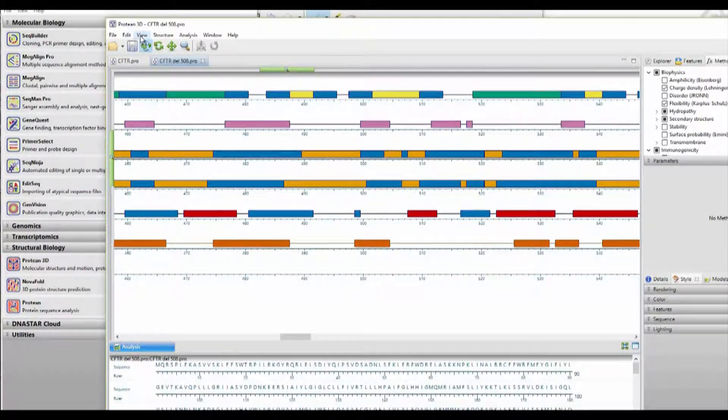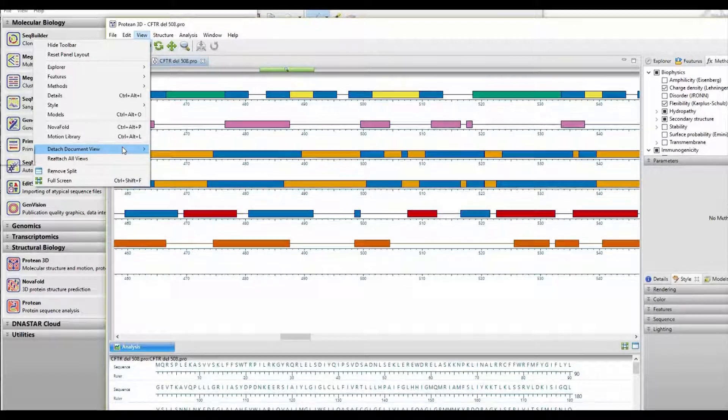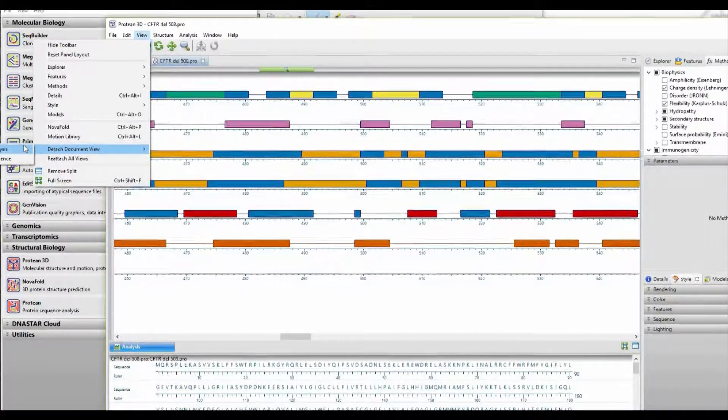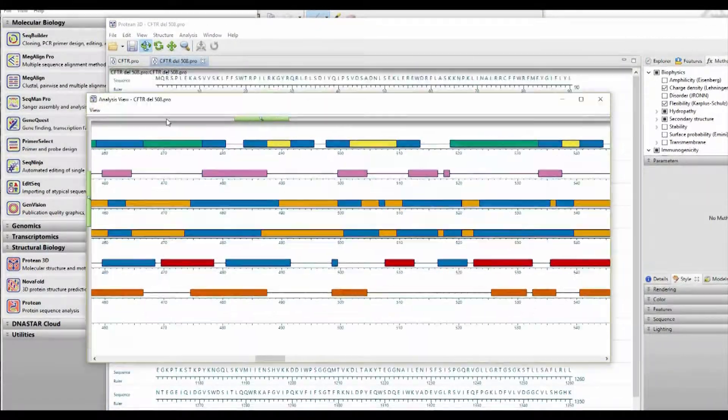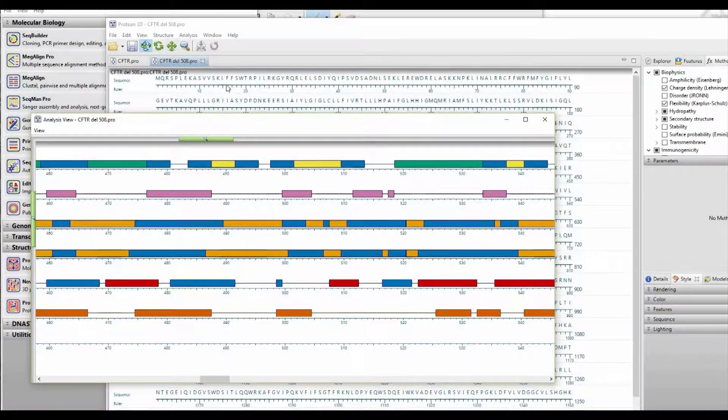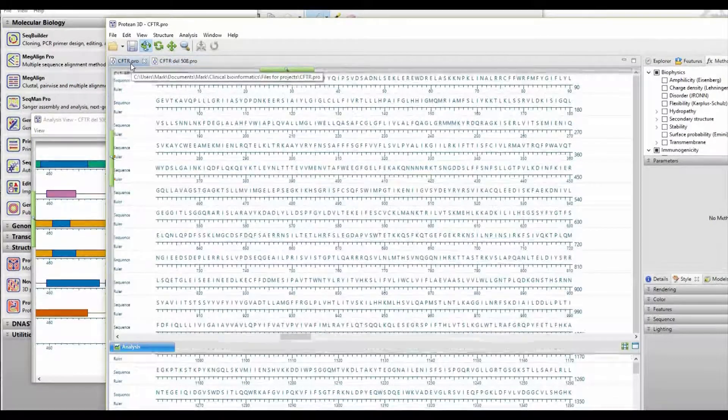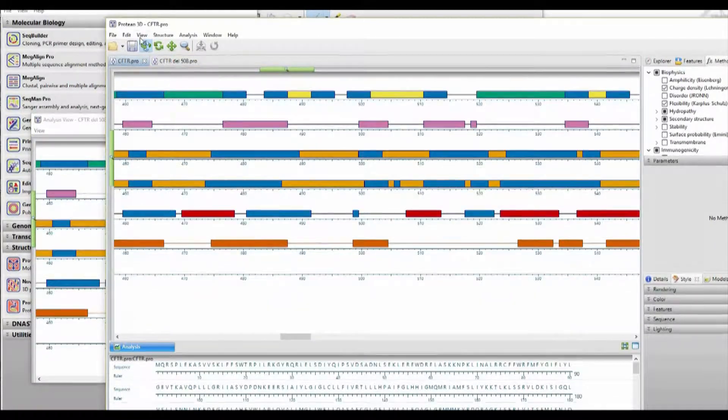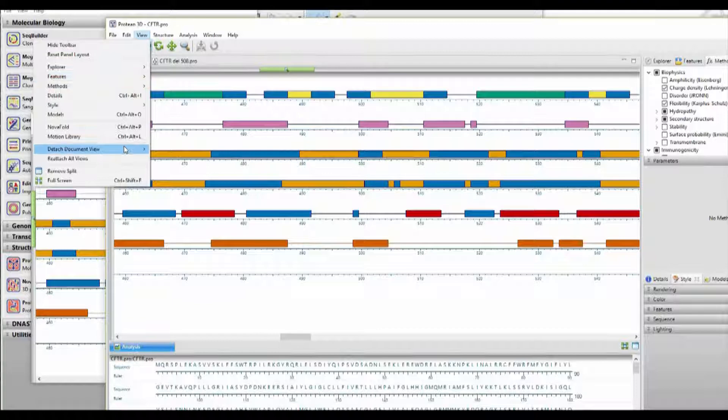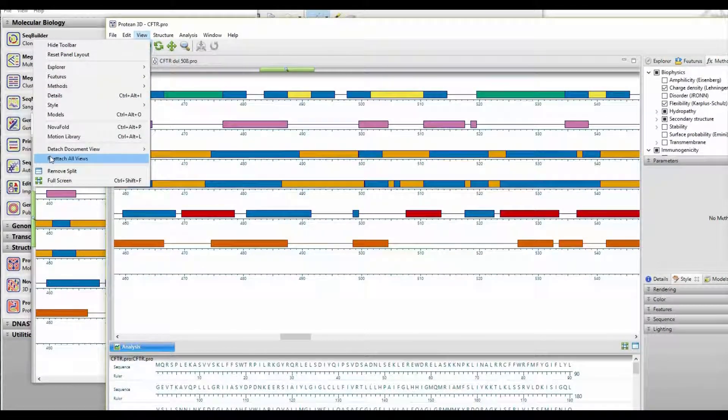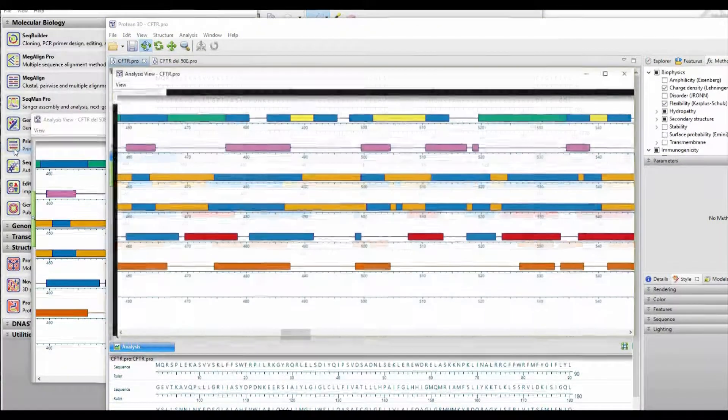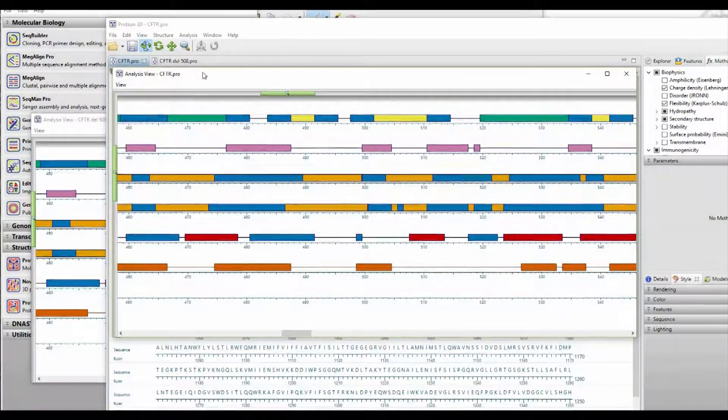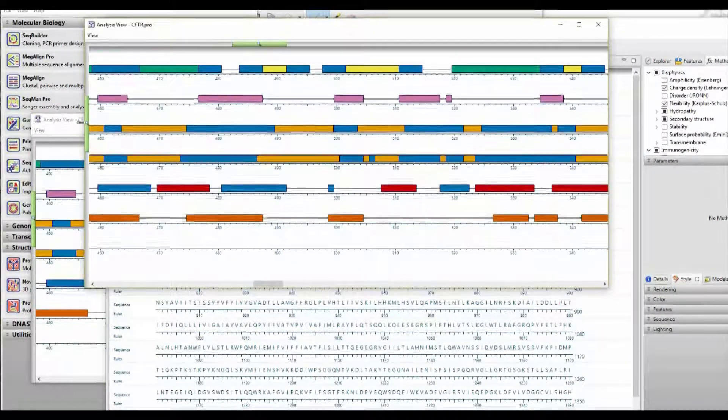In order to do that, an easy trick is to detach the analysis window. So we detach each of them, as I'm showing here, and we'll detach the other window.